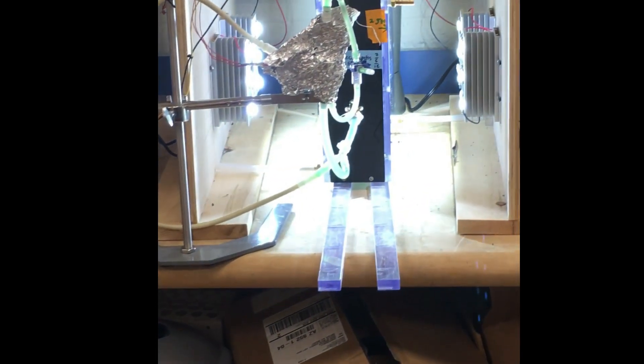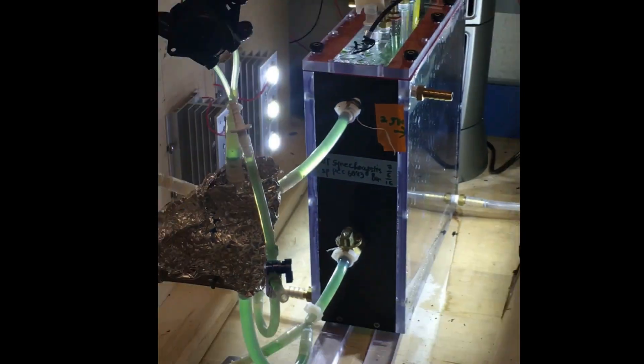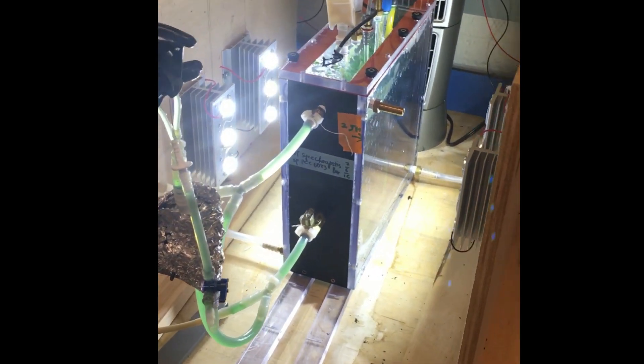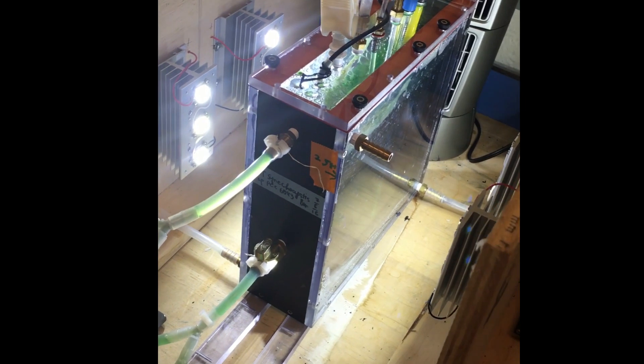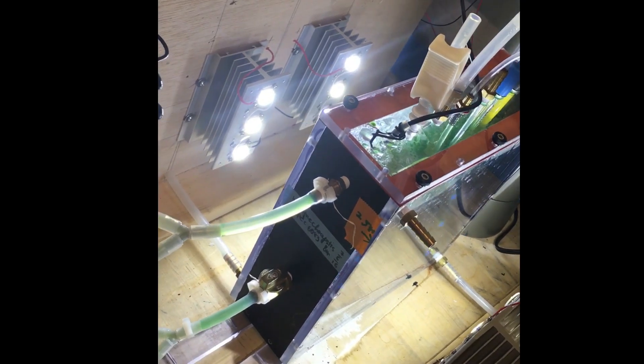In this setup, I have about four big blocks of aluminum and each of them have LEDs at 10 watts. So I have about 120 watts of energy applied output.